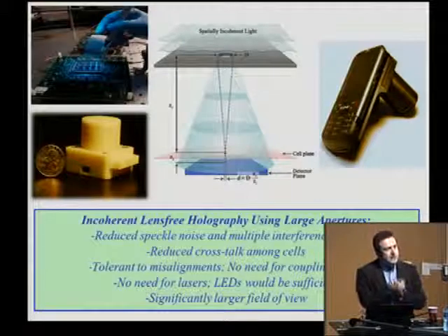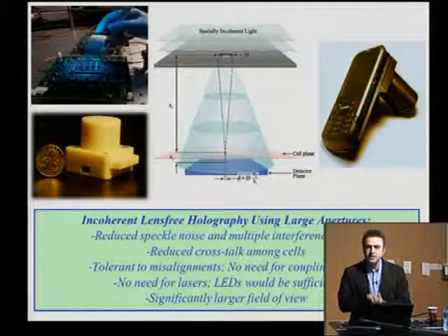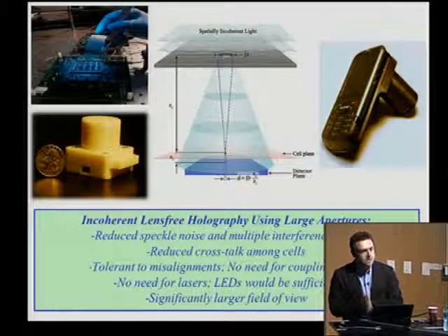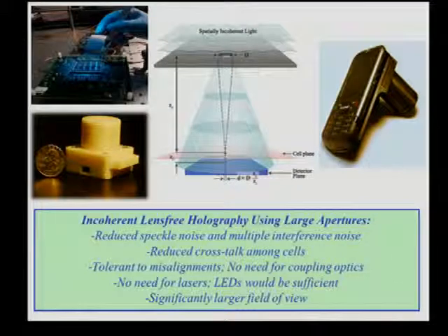So this is a holographic lens-free microscope, but its design is unique, and it's different than traditional digital holographic microscopy techniques that were out there for quite a while, in many ways. First of all, this is incoherent or partially coherent light, both temporally and spatially, meaning that our bandwidth here, for temporal coherence reasons, is not as demanding as a traditional coherent holographic microscope. It can be a few nanometers or maybe 10, 15 nanometers, depending on your resolution need. So in that regard, an LED would be a great candidate for illumination.